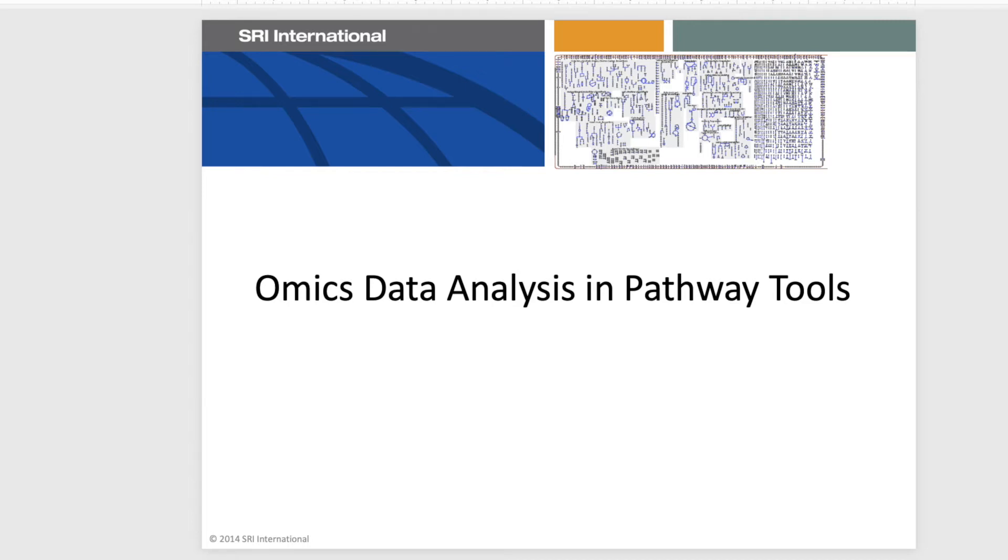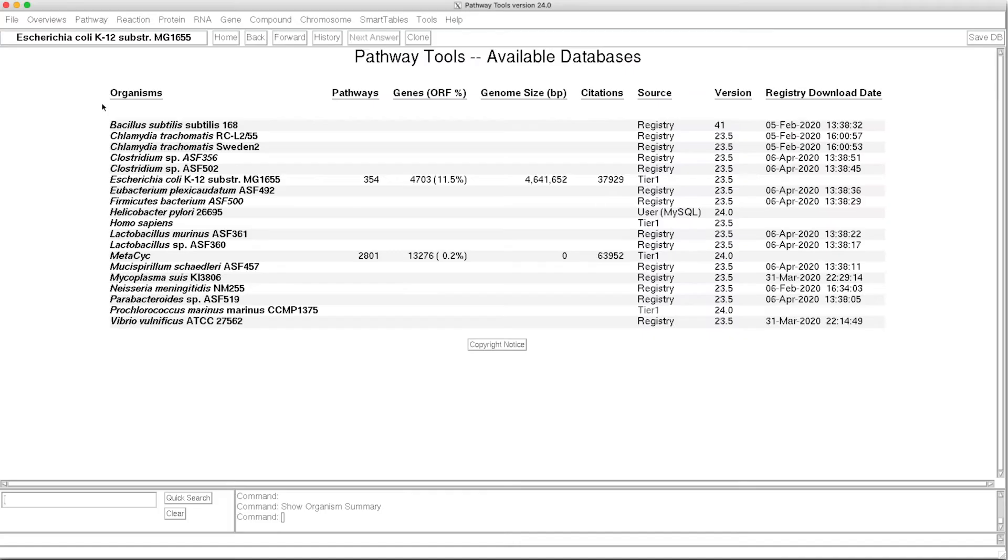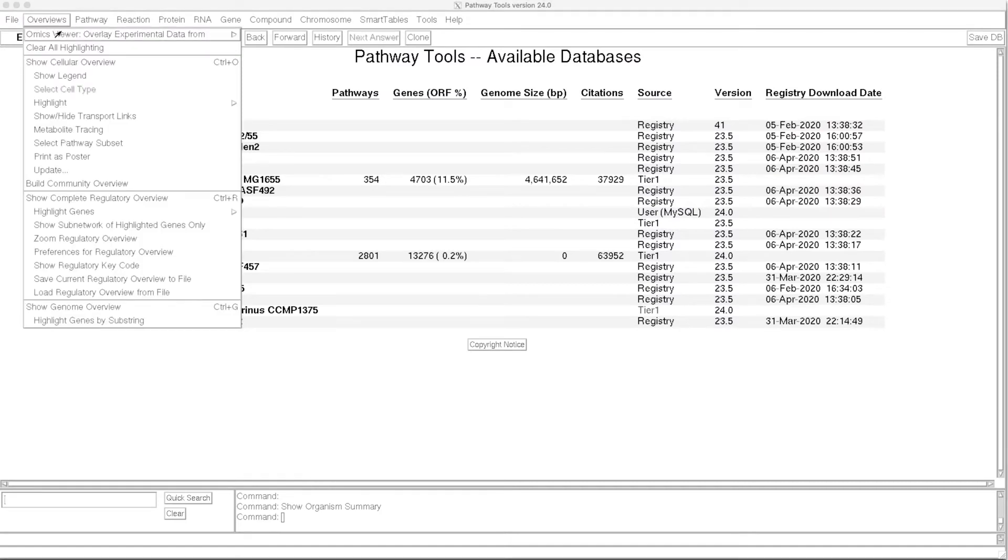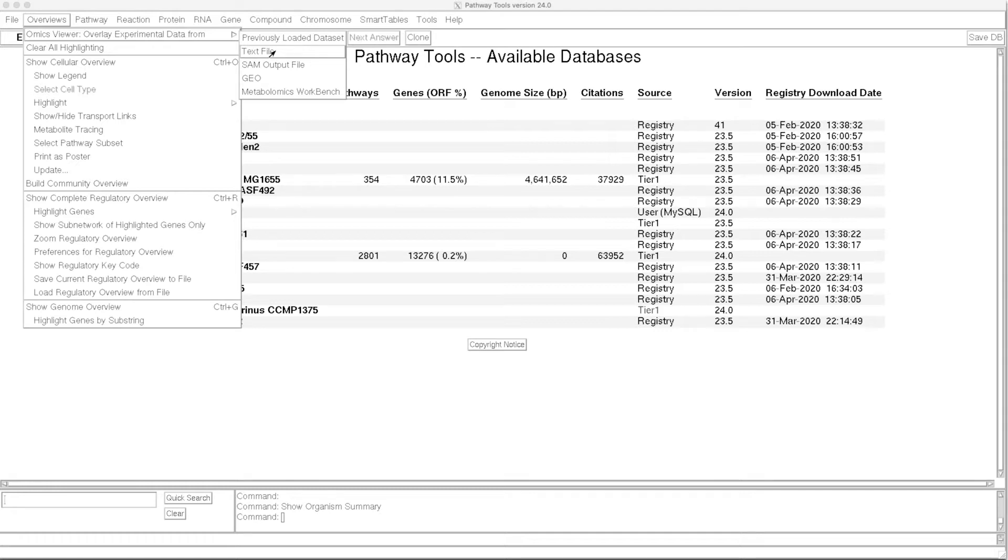In this video, we'll take a look at omics data analysis in Pathway Tools. We invoke omics data analysis through the omics viewer menu, and we're going to read our data from a text file.